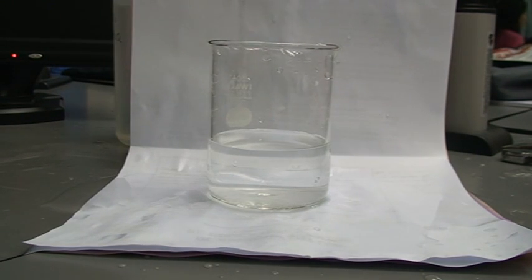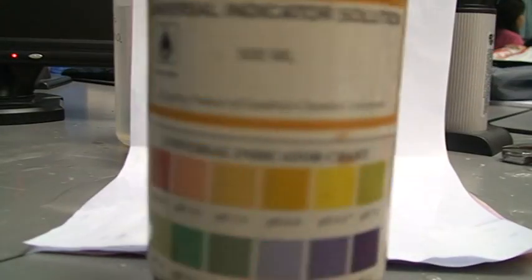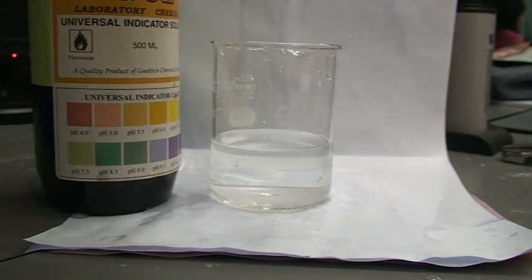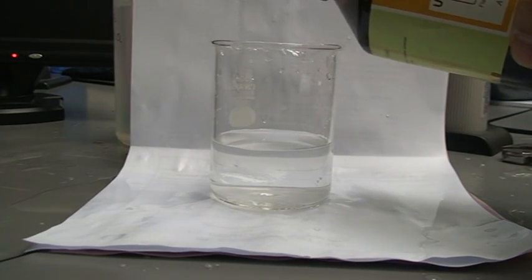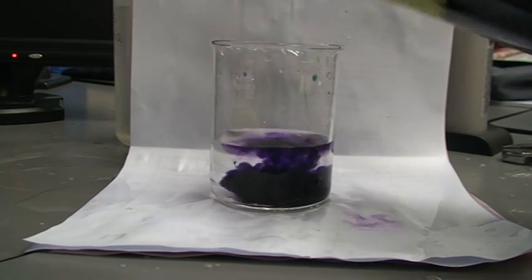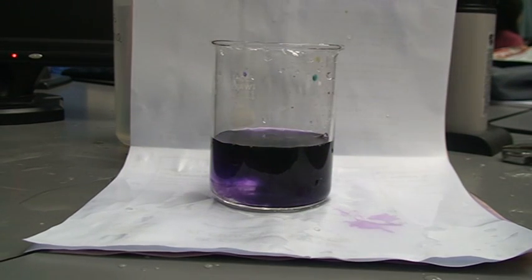And if it is saturated lime water, if we put a universal indicator in. As usual, we're going to pour. We've got too much. We're going to pour. Can you see that it turns purple? It is quite alkaline.